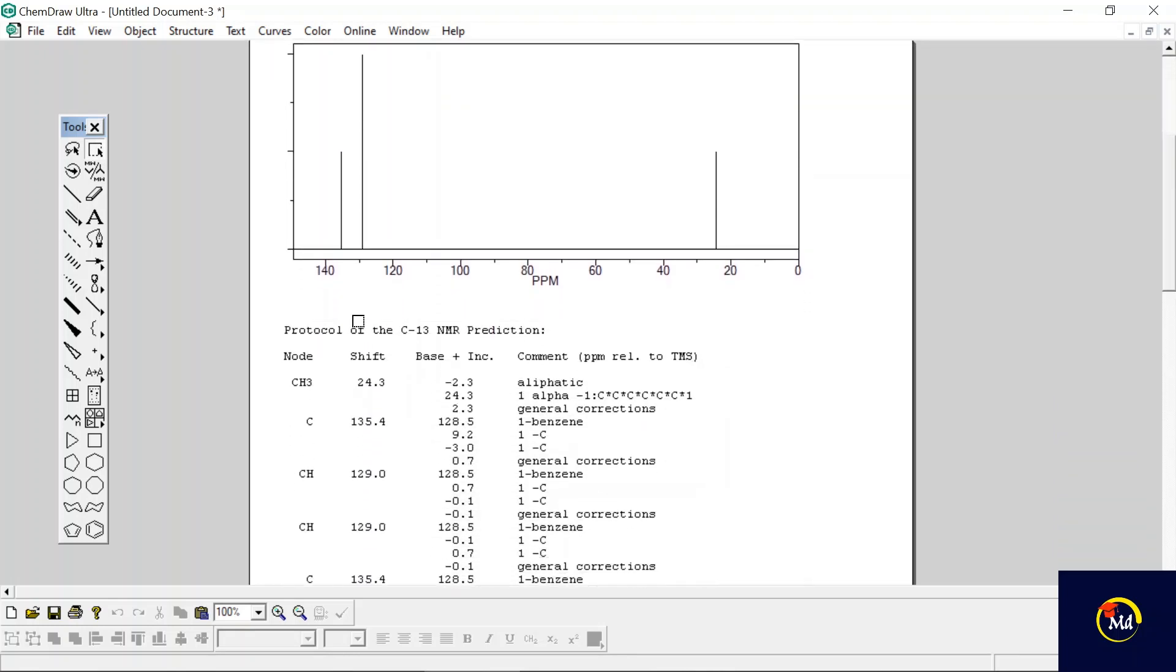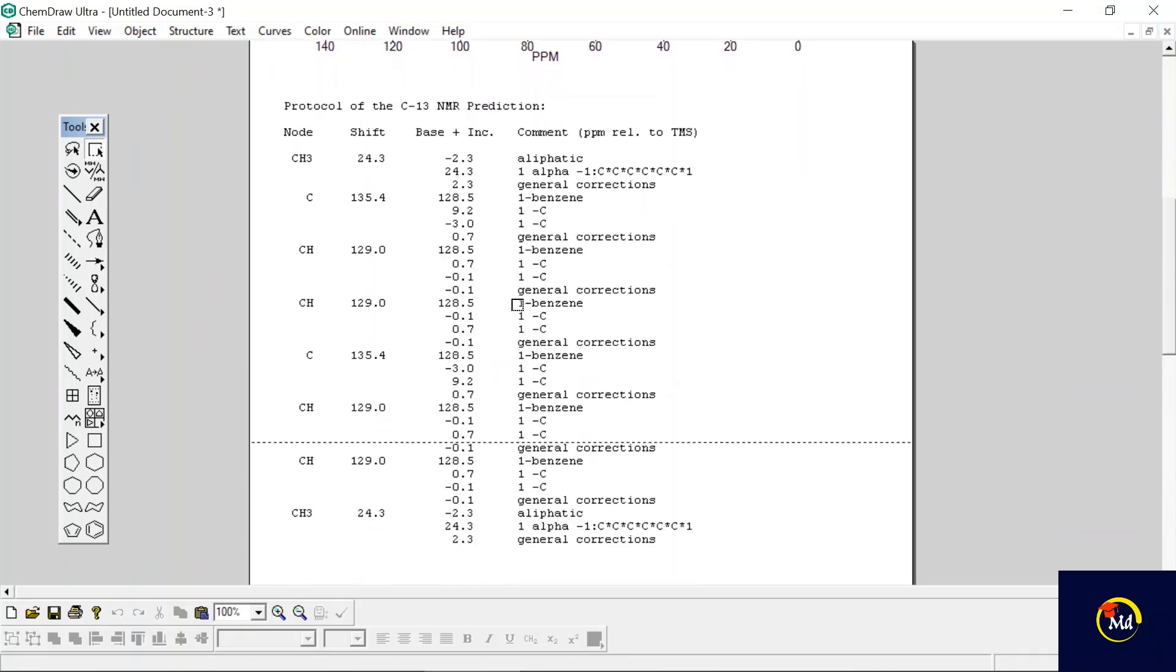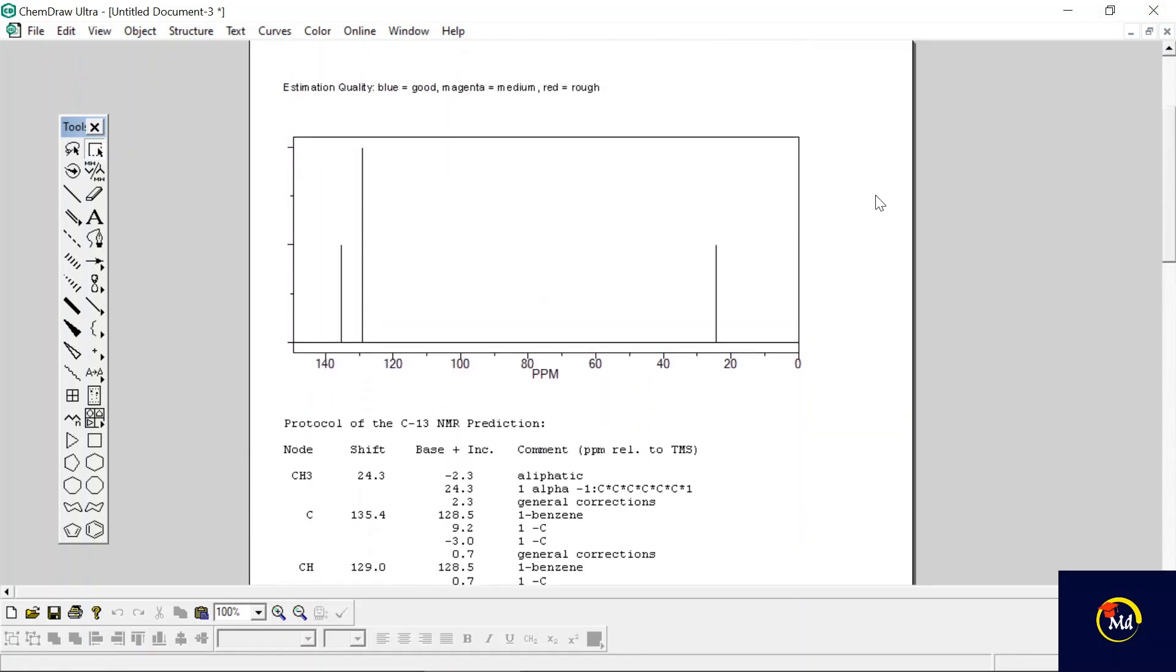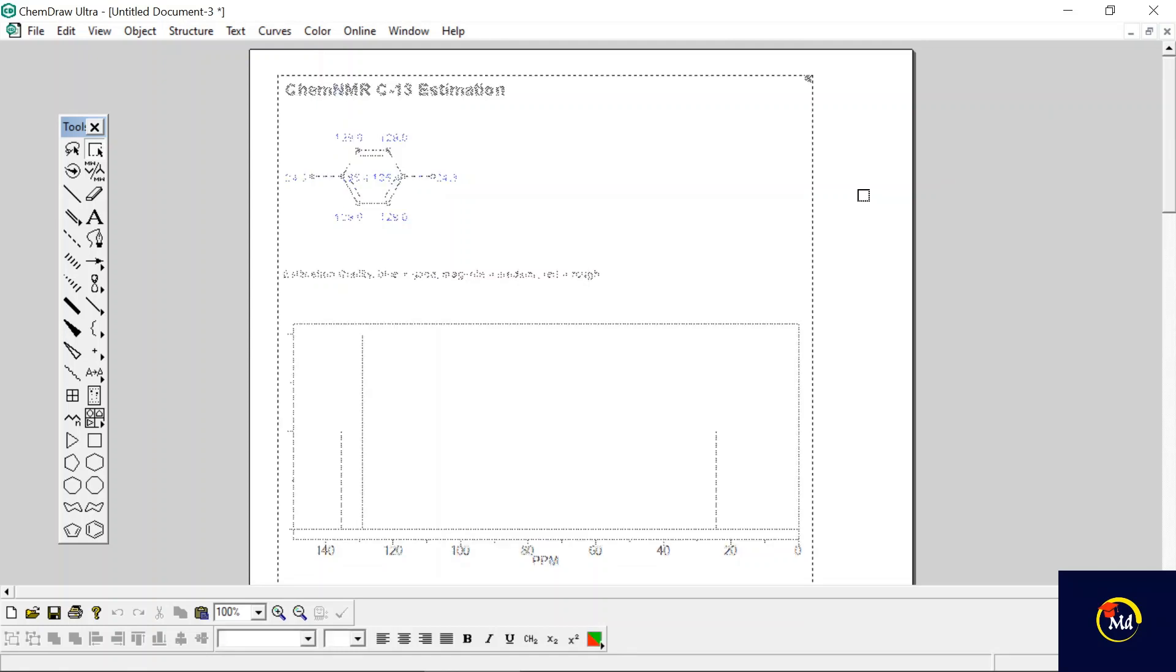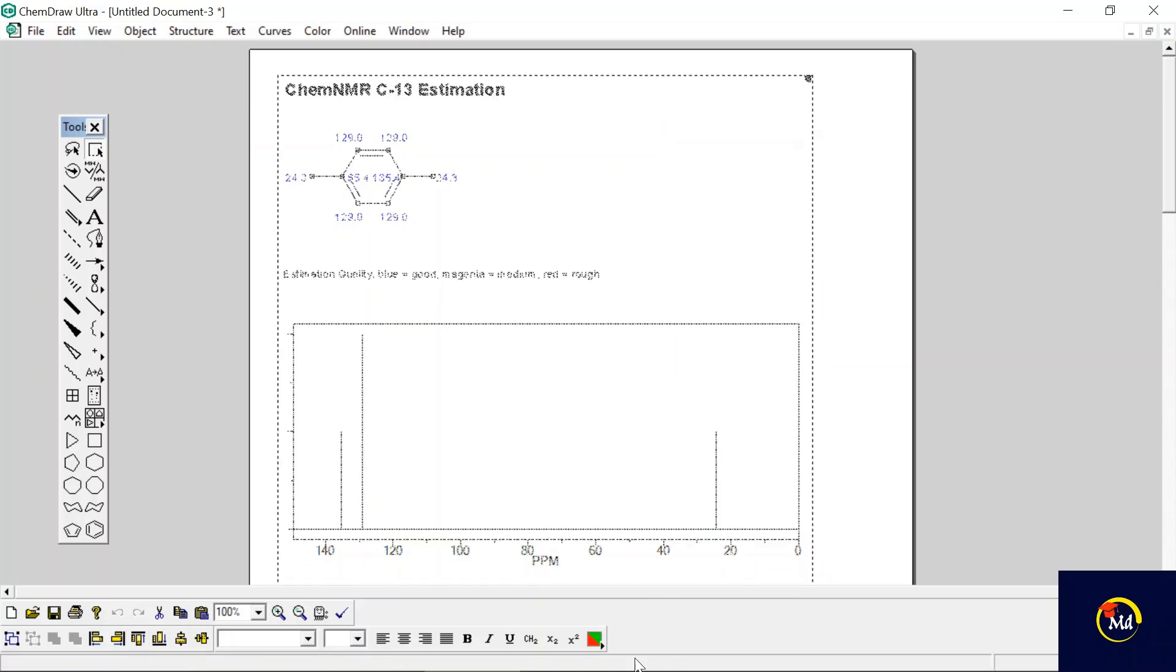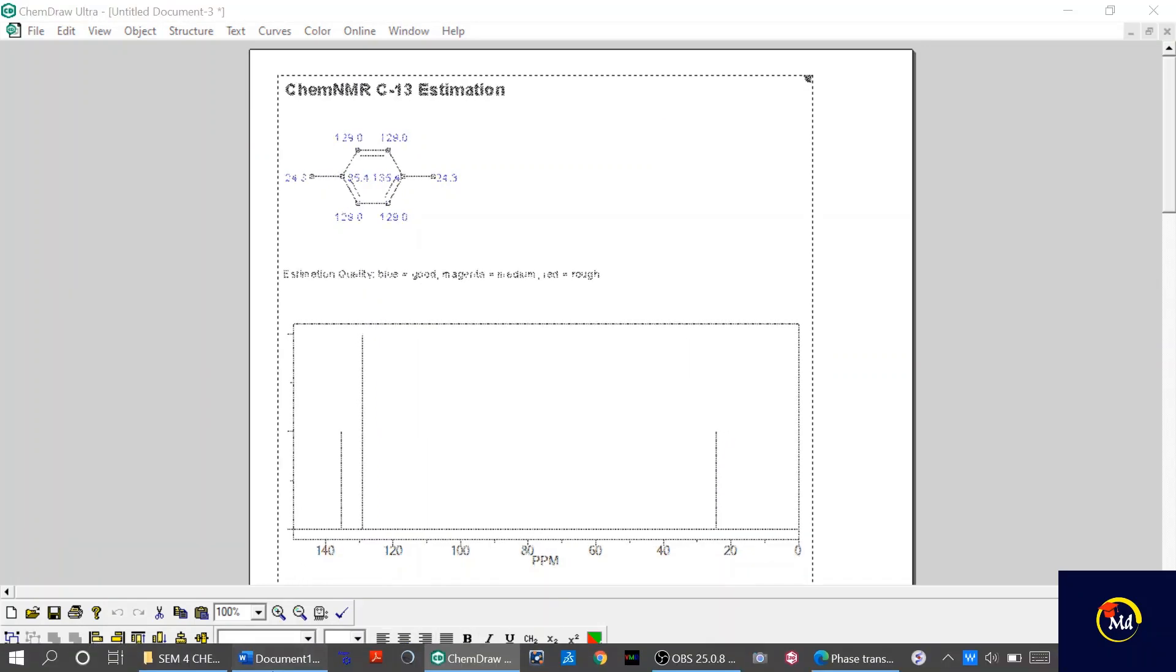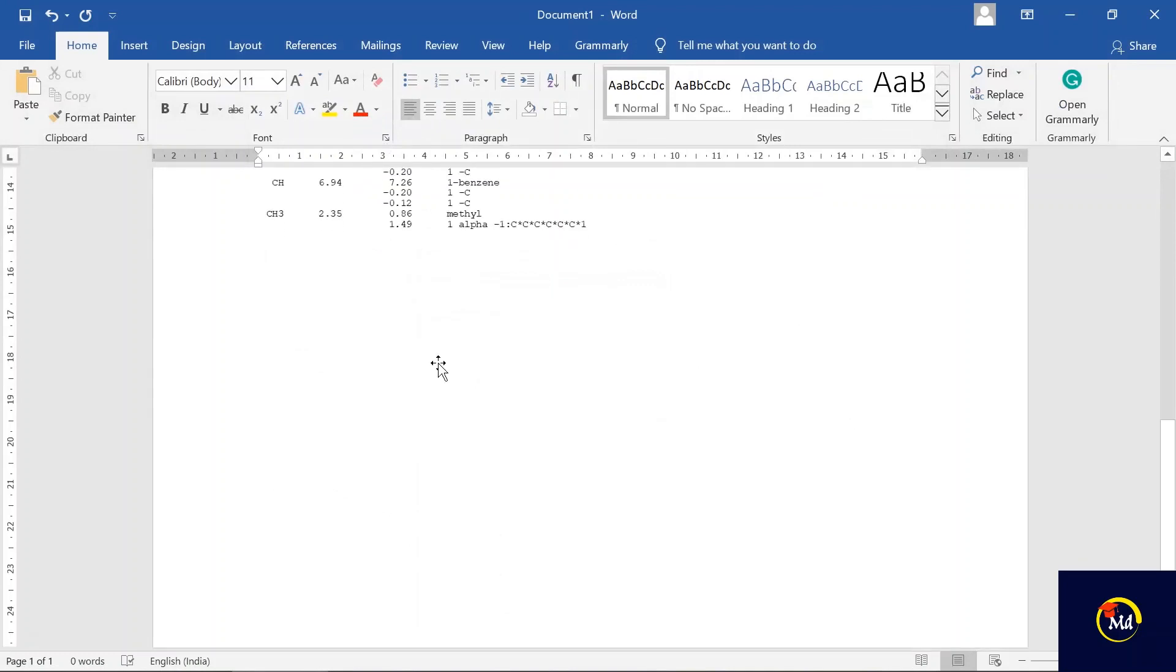The table is described below showing the number of shifts and the carbon. Again if you want to compare carbon-13 NMR shifts and 1H NMR shifts, just copy it from here and paste it on your Word file. Paste it below.